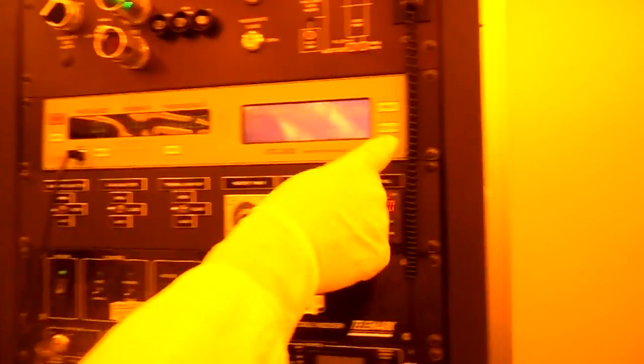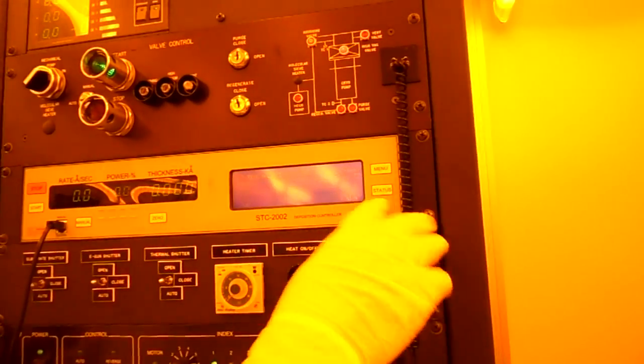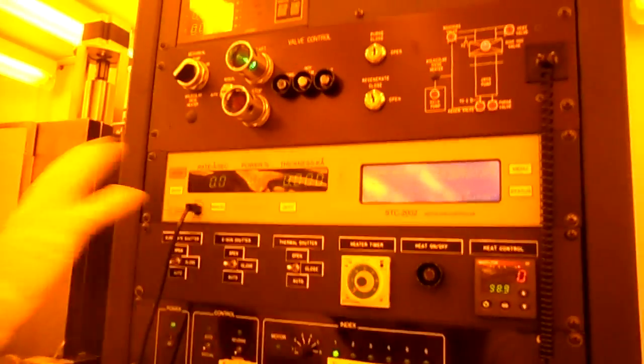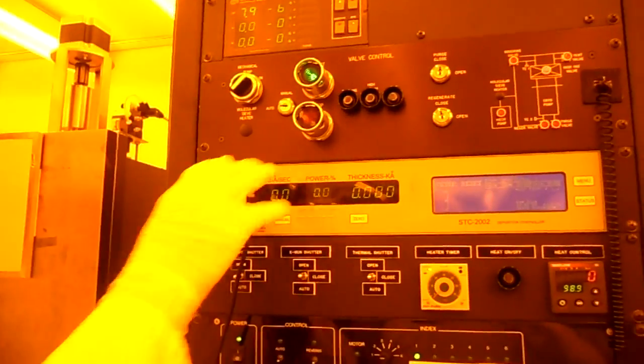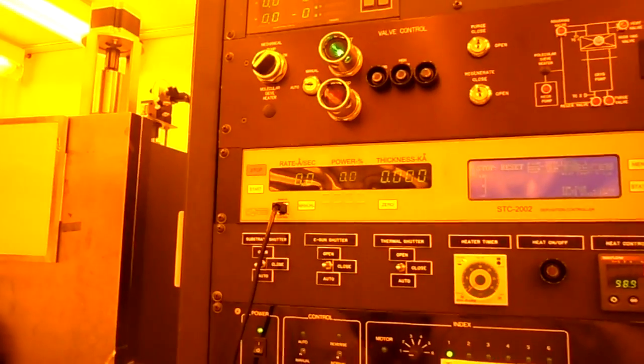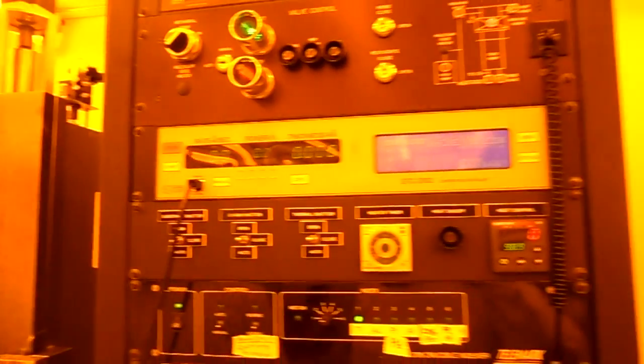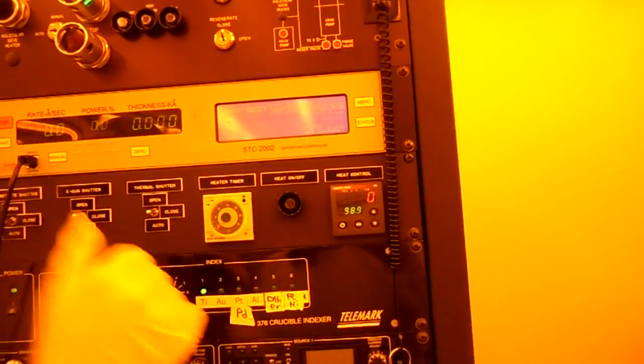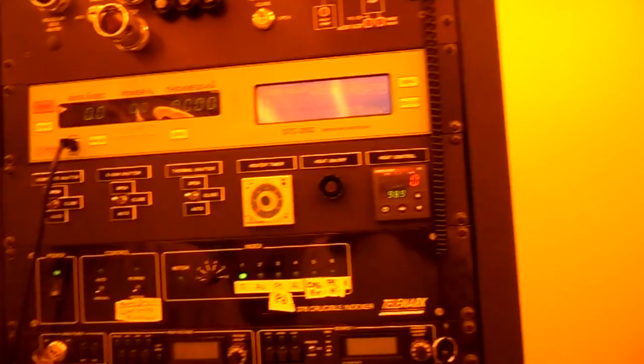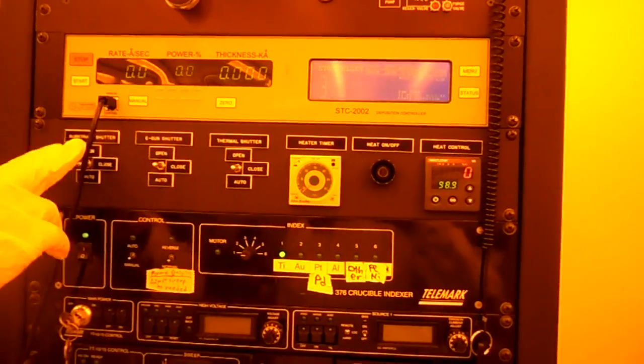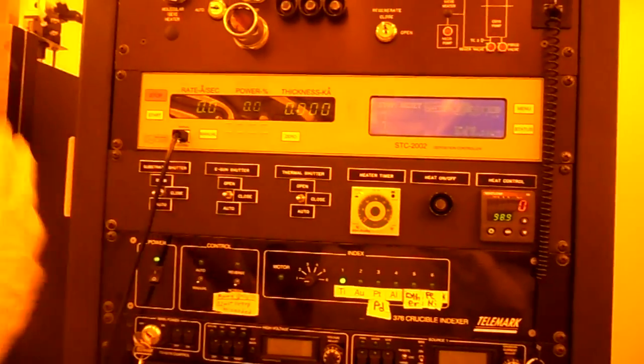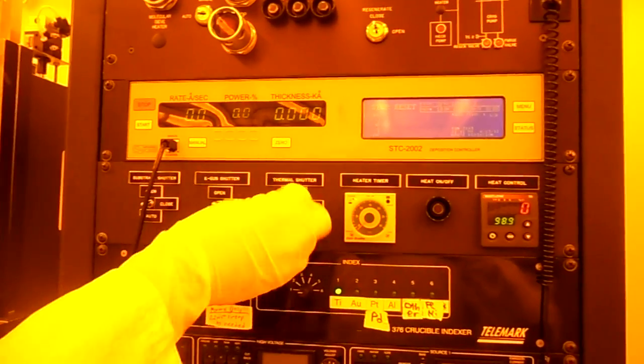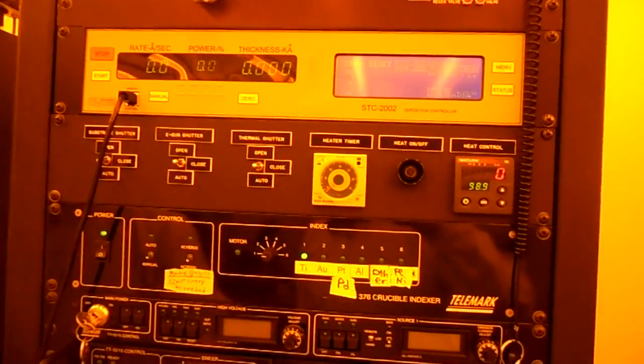So we're ready to turn things on. And I'll point out that you could refer back to this if you need to in the future, but today we'll just talk about it hands-on here. Next film should be 1, so that's correct. Now we can try to run the instrument from here, but we haven't turned on the high voltage yet, so it's not going to work very well. We're on position 1, that's good. Both of our shutters are closed, and that's fine.